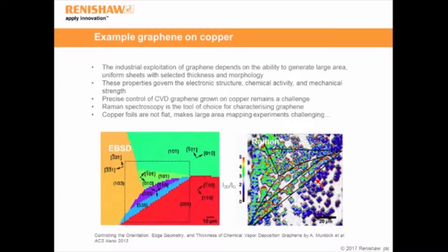Here we are looking at how the underlying copper orientation affects the thickness of the graphene flakes grown on top. The left image is an electron backscatter diffraction image, and it covers a much larger area than the Raman image — simply because we were only able to maintain focus over a limited area in the Raman image. Beyond that, we go out of focus and that affects our results. However, with LiveTrack I would have been able to do the whole image.